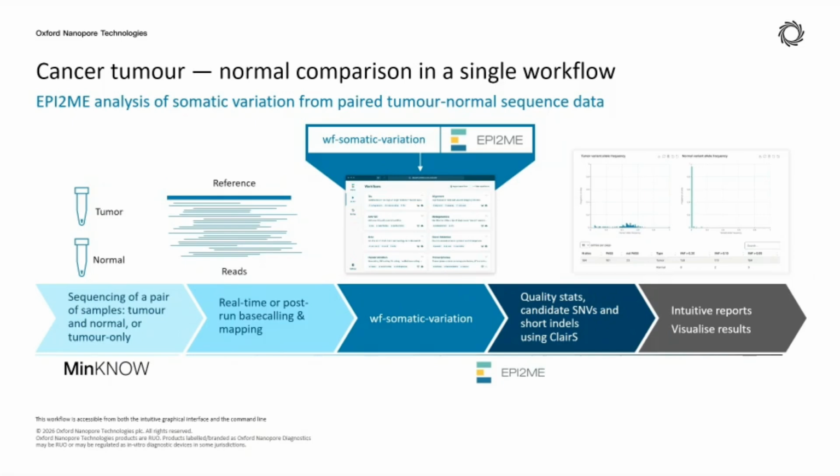So the software or programs used in the somatic variation pipeline will be different from the normal human variation pipeline or human genome analysis pipeline. The software will be slightly different, but all of this will end up with reports, and then we can visualize the results in perhaps a genome browser in order to monitor closely or investigate further on the data.